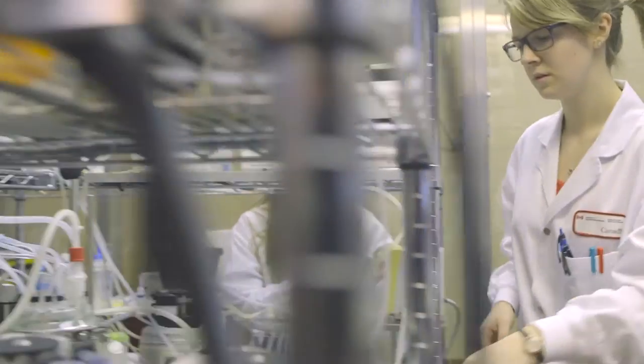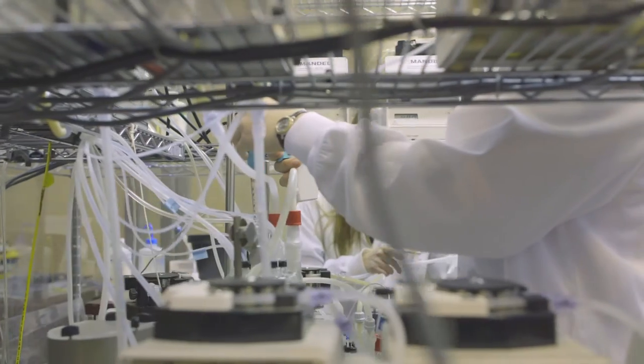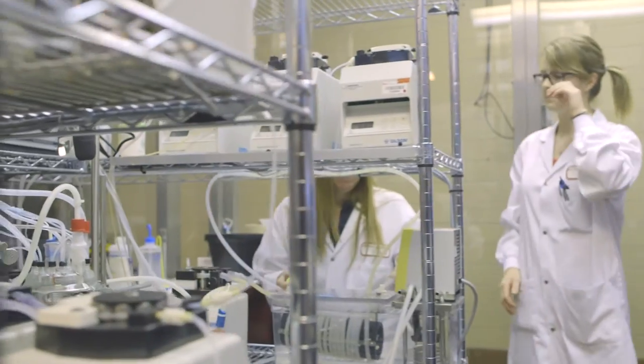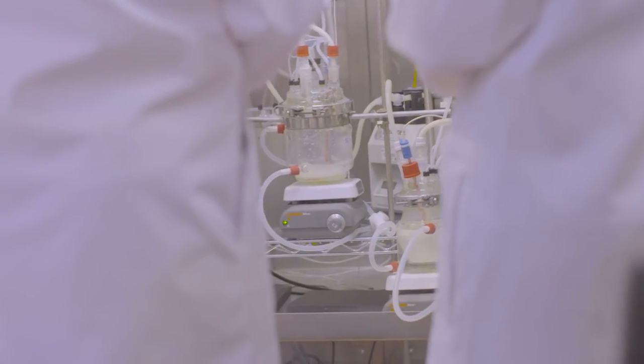Our researchers use it in a number of research projects, in particular to improve the survival of probiotics in ferments and consumer products.